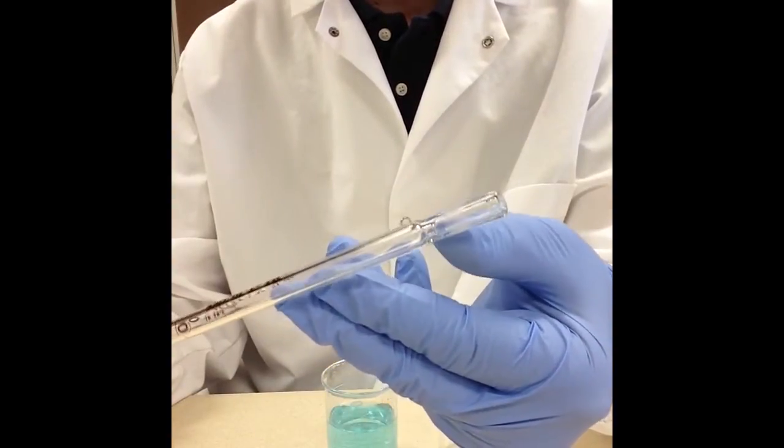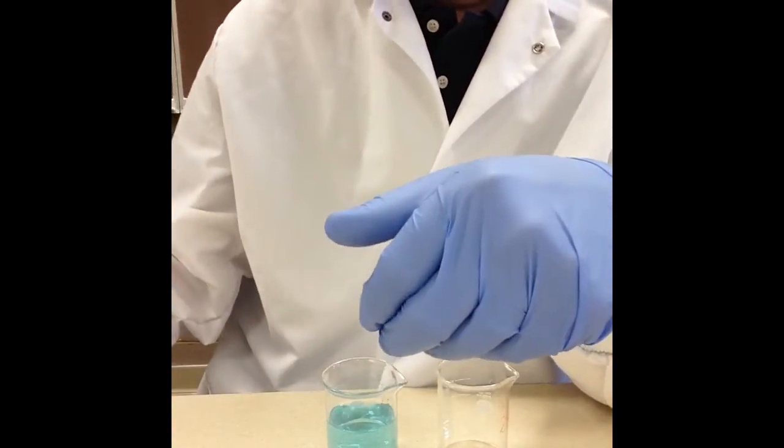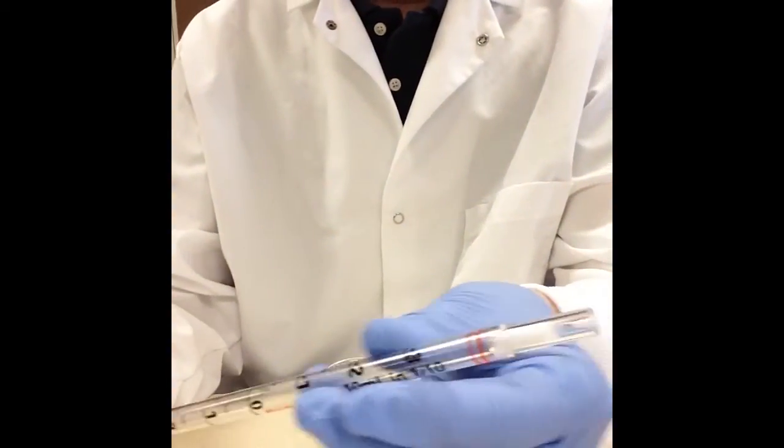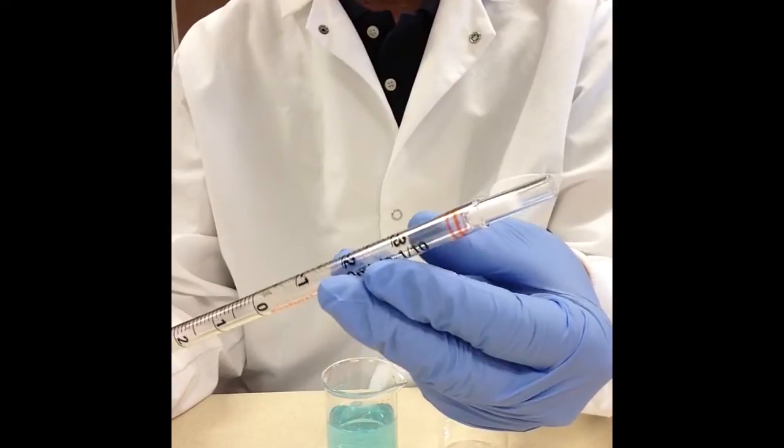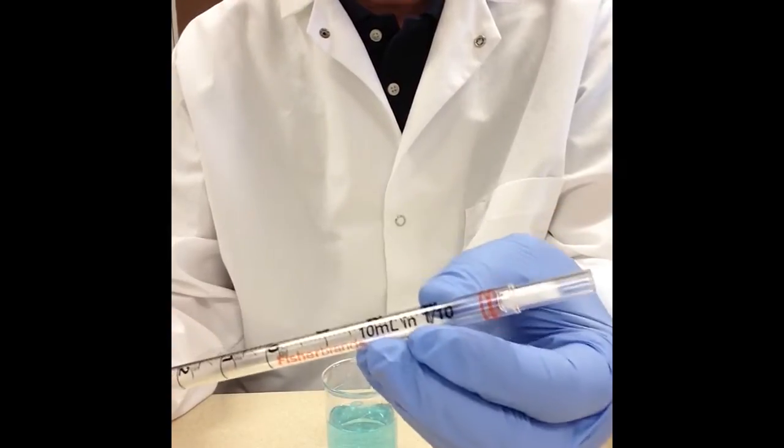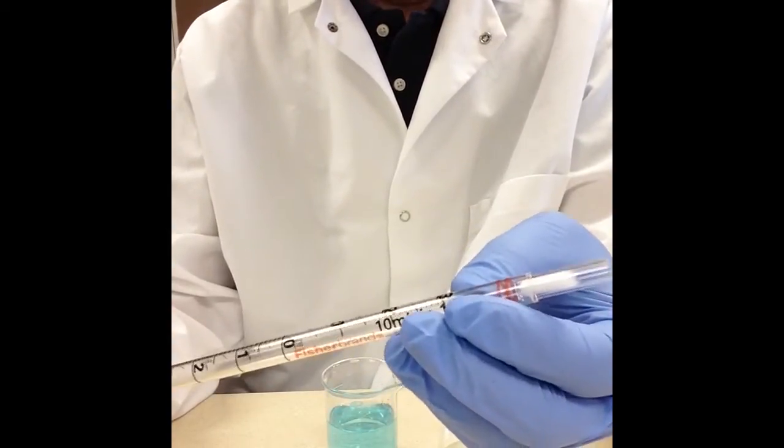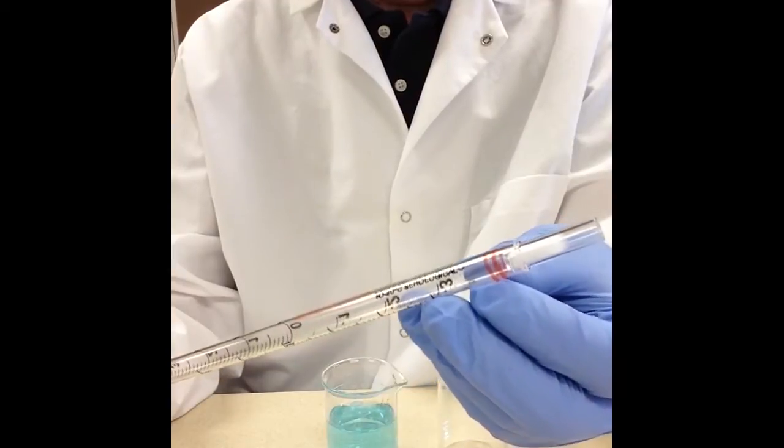But another thing that we're looking for is whether there is a ring around the top and this one it's a little bit faint but there's this etched ring that goes all the way around the top of the pipette. And on this disposable one there are two colored red rings that go all the way around.